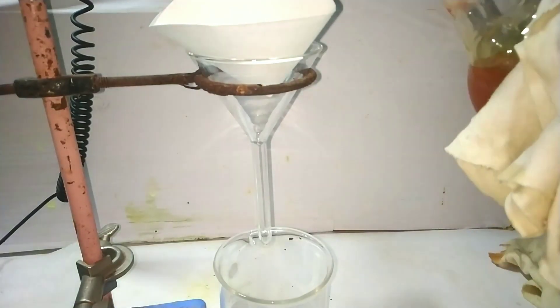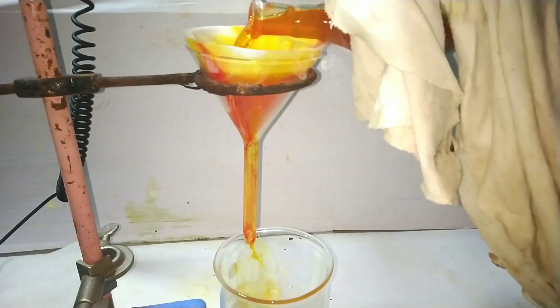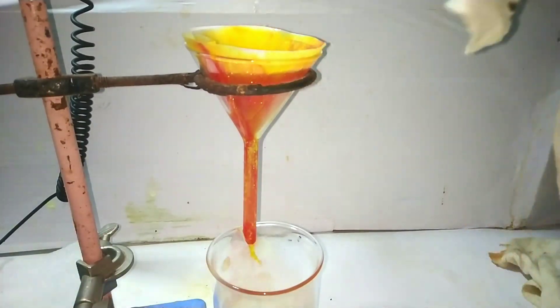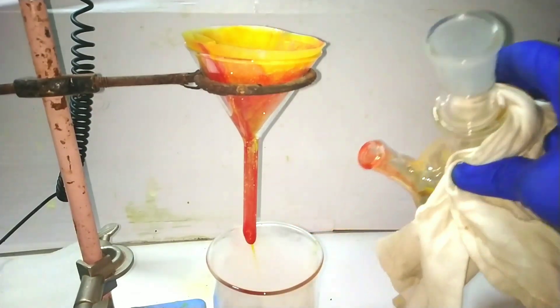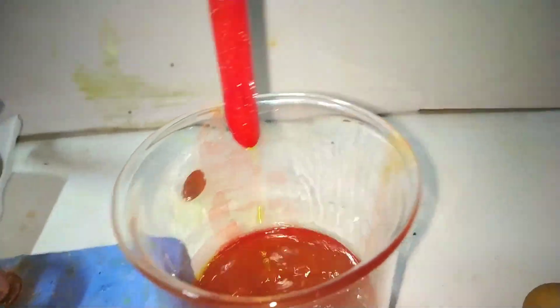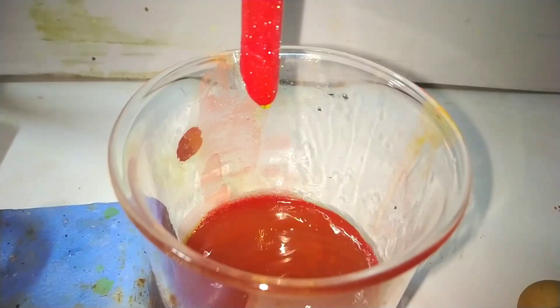Now take out the flask and very quickly filter the solution while it is boiling hot. Even though I rushed, some of the antimony 3 iodide crystals crystallized in the funnel and the filter paper, so I had to boil around 20 milliliters of toluene and pour it into the funnel to dissolve the compound and wash it down to the beaker below. Here I am decanting the solution into the beaker to bypass the filtration step, but you can see the red colored crystals of antimony 3 iodide already clogging the funnel.